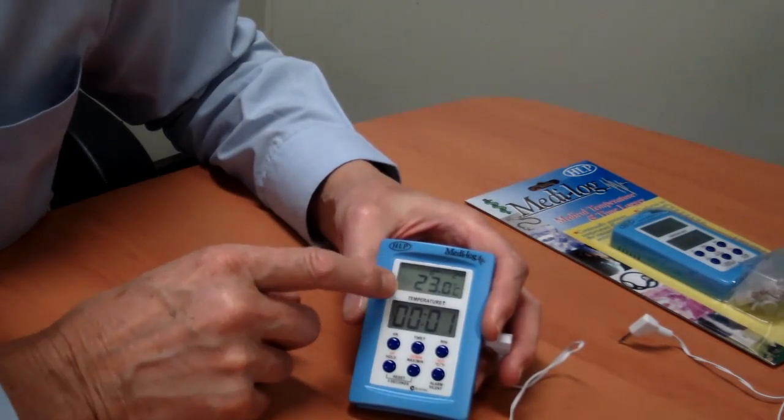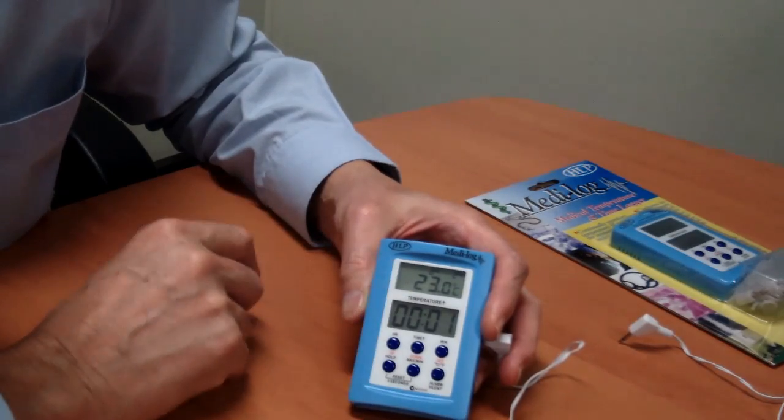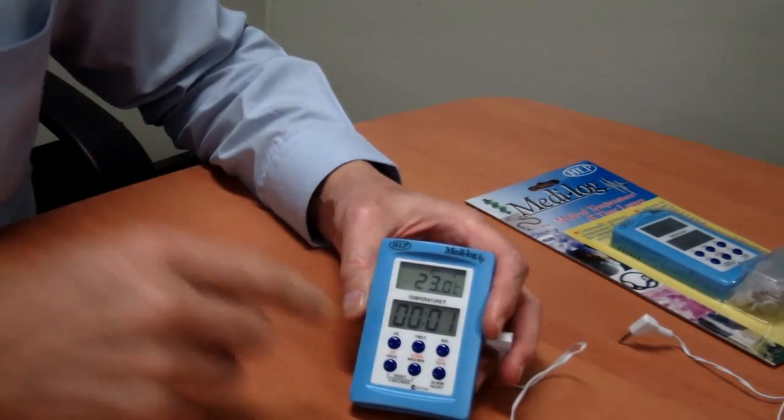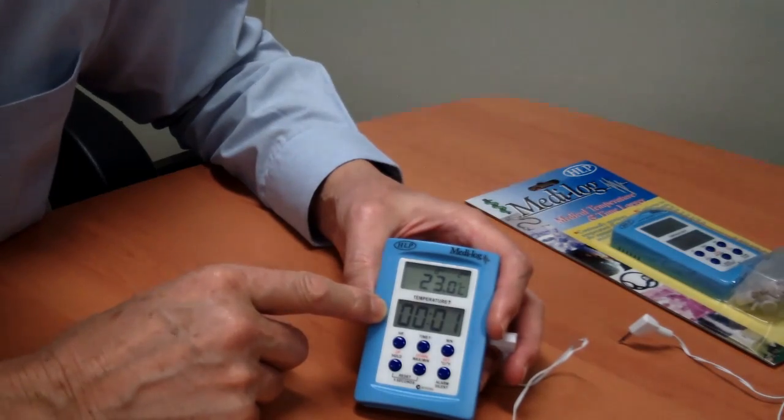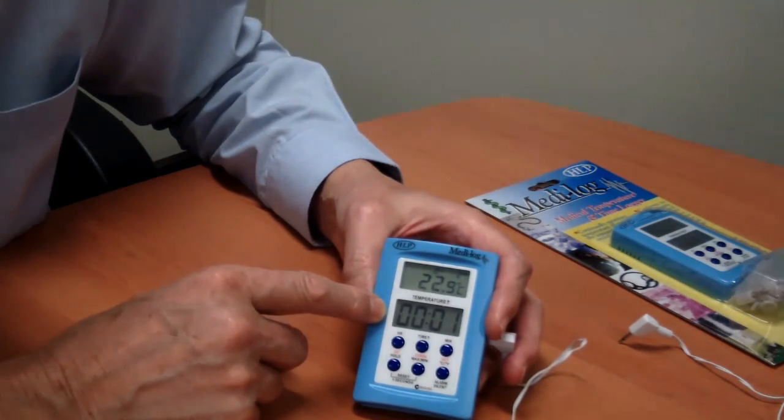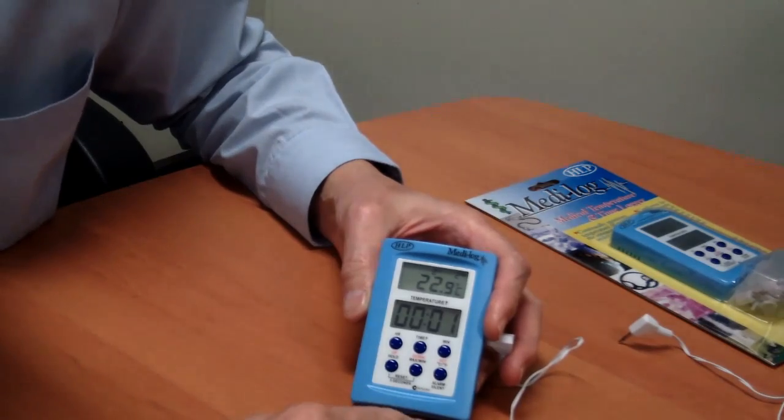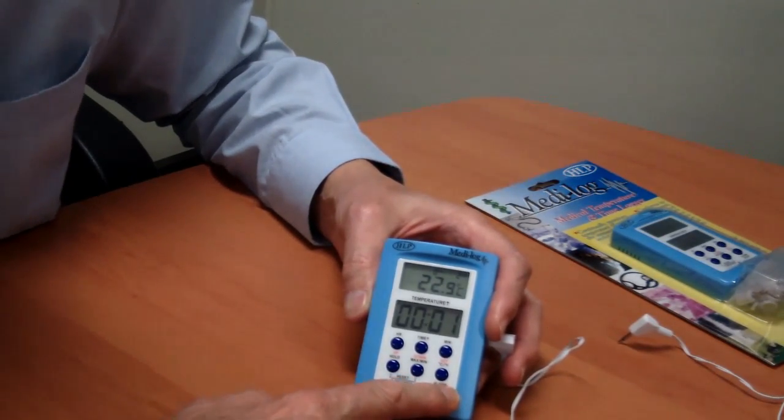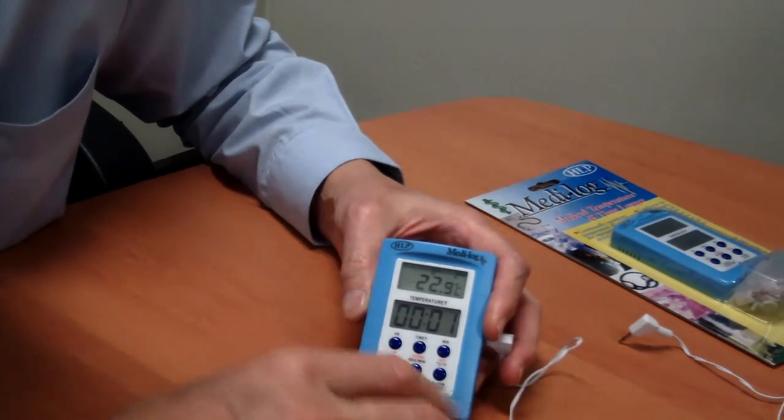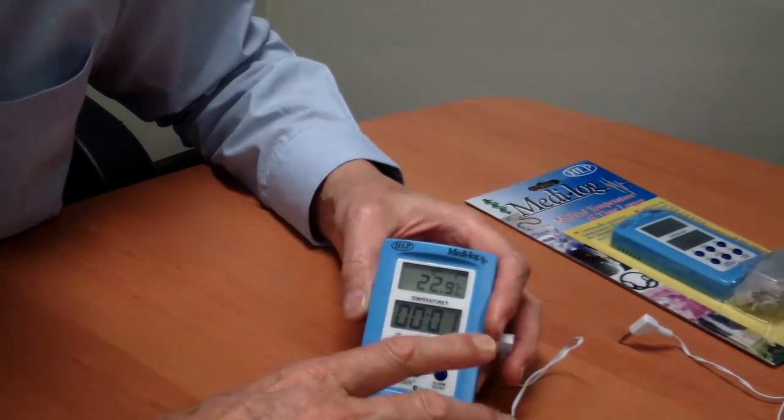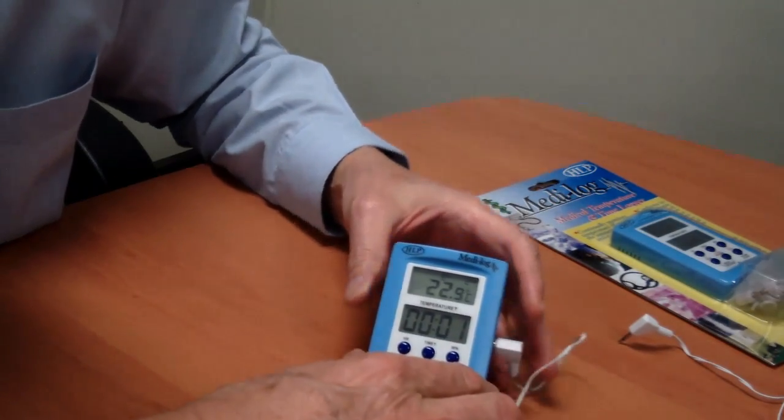The bottom display is going to show me how long the unit is out of temperature. So if the unit is out of temperature for one hour and 20 minutes, the bottom display will show 120. Now that will keep beeping like that for as long until somebody comes and resets it.